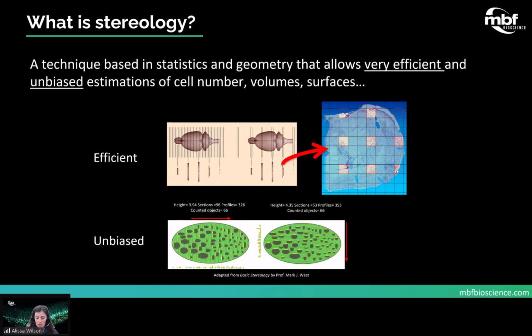On the other hand, if you are using the SRS acquire option, the grid spacing would need to be done during the setup of the acquire process. For example, this can be done in Stereo Investigator using the SRS stack acquire workflow. And because you are only acquiring the stacks at each SRS site, so the ones that are highlighted, this type of acquire does save resources and acquire time.